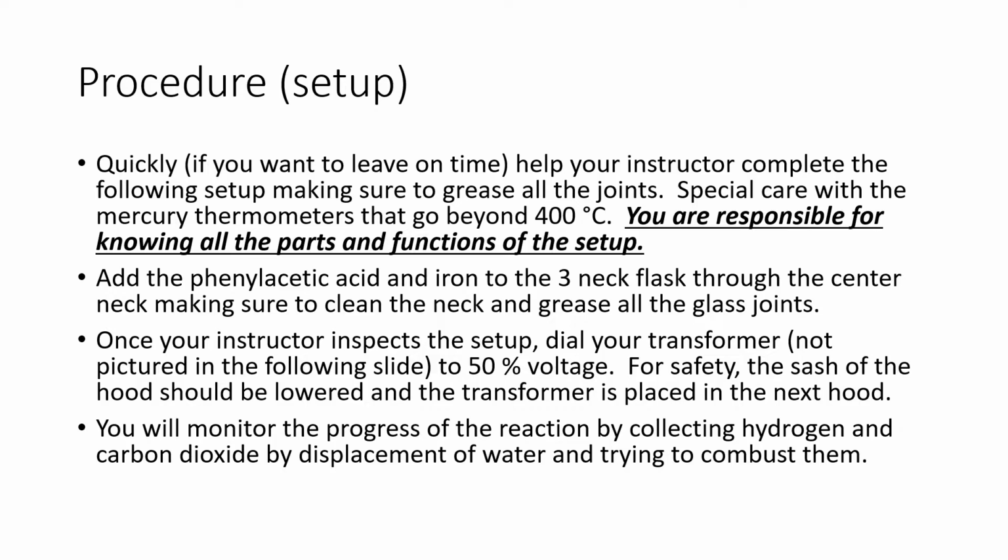So I'm going to just quickly go over the setup. Normally you would do this in the lab and then have the TA or the instructor see if you performed it right. But what's very important for me to mention is when you go into a lab, it's very important to understand what you're going to be doing in there, as well as any type of setup that you need to perform. So just make sure that whenever you're going to perform an experiment, understand if you need to set up some kind of glassware, how the glassware should be set up.